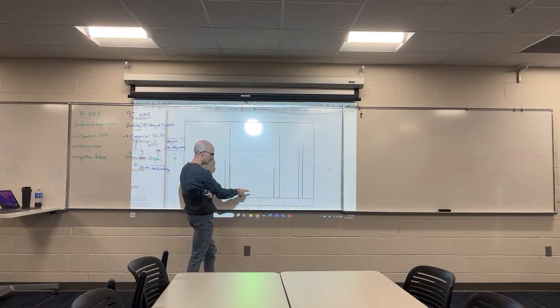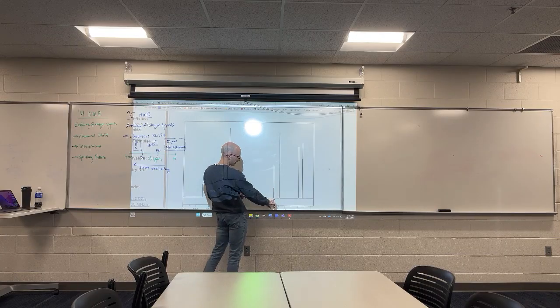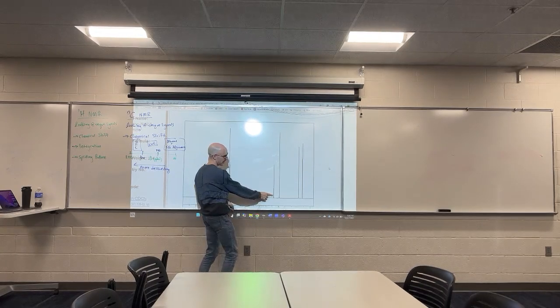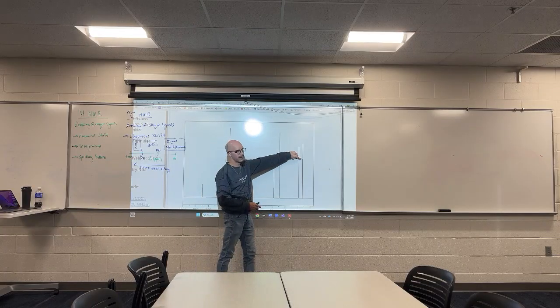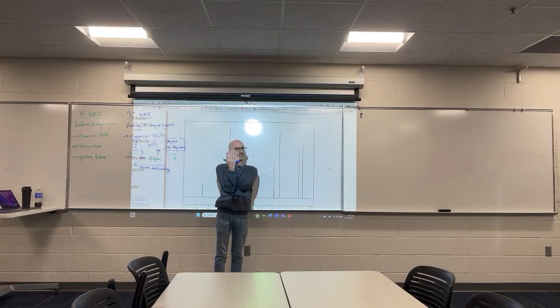60. Oh, here? Yeah. This does feel like, you can see how it's wide at the bottom and then it's narrowing in. This feels like pixelation. Like this is just getting more and more narrow as it gets towards the top. But this one is wide for a very long time. That makes me think that this is almost a superimposed signal.